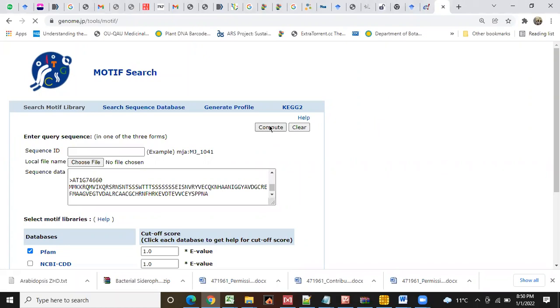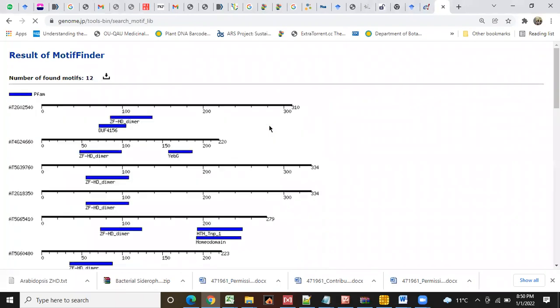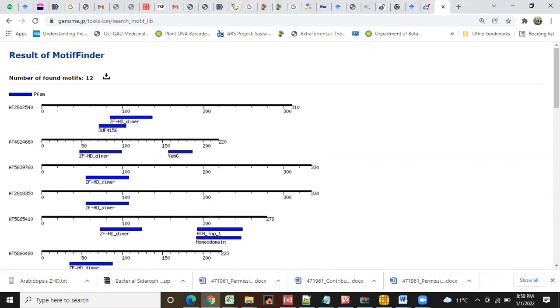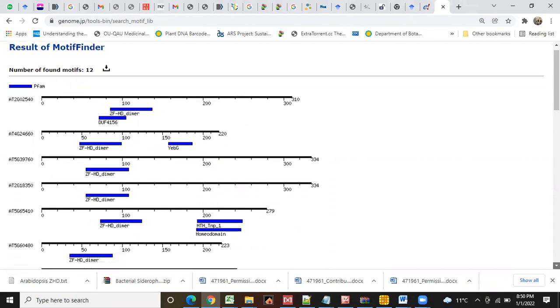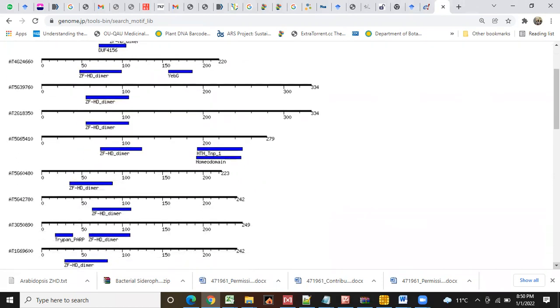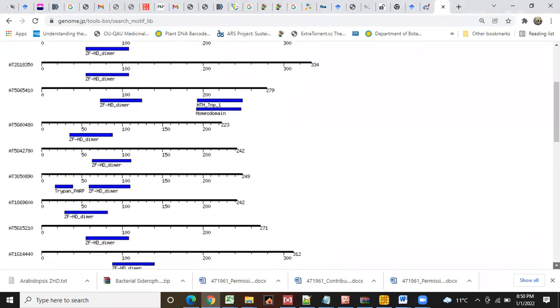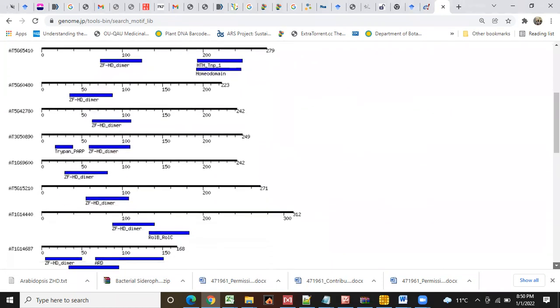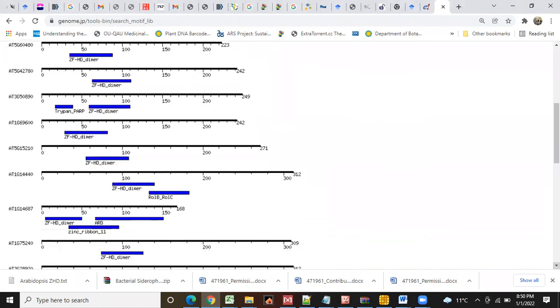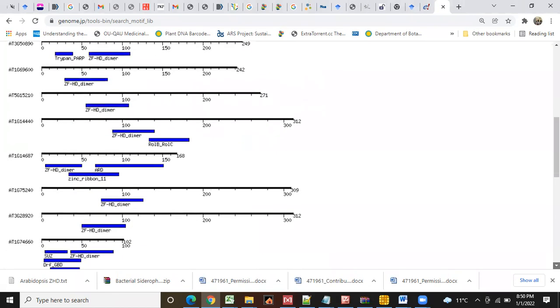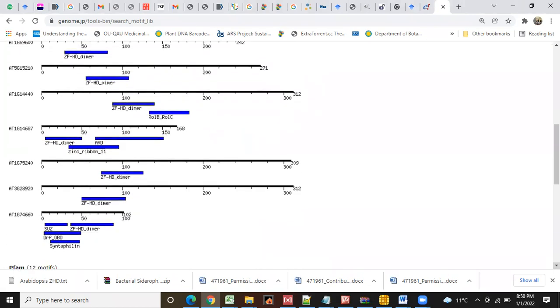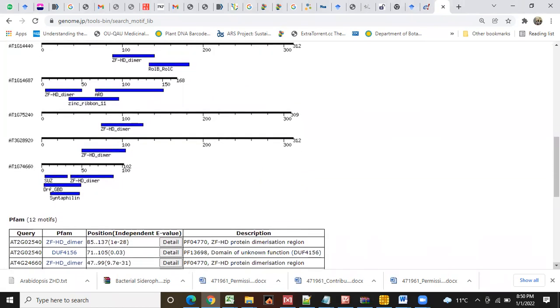I just added all these Arabidopsis sequences, so the method is to understand whether all these sequences have ZFHD domain or not. This ZFHD - zinc finger, abiotic stresses - so all these genes have ZFHD finger domain, that's great.